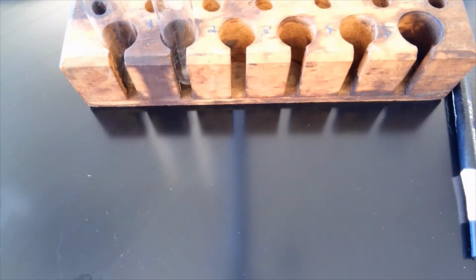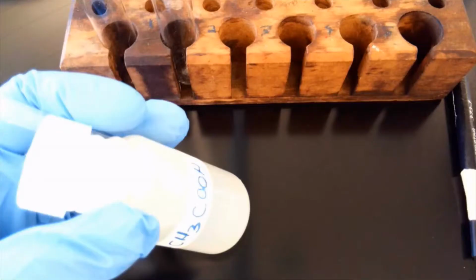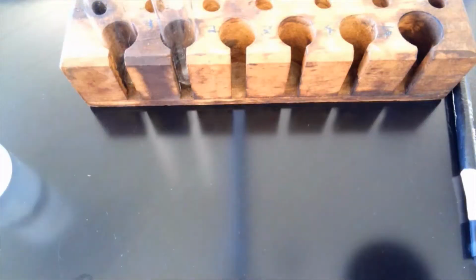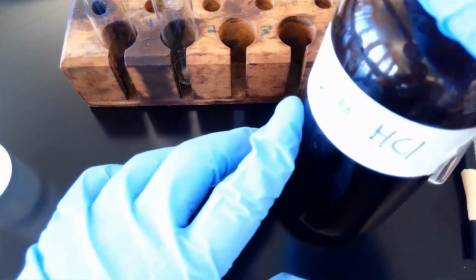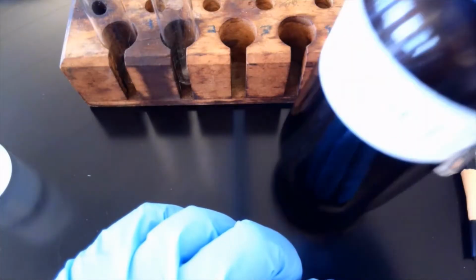What we're going to do now is see how acids react to metals. We are going to compare 6 molar acetic acid, it's right here, and that's a weak acid, to 6 molar HCl. Oh, sorry, it's a little hard to see with the glare. But 6 molar HCl, and HCl is a strong acid.